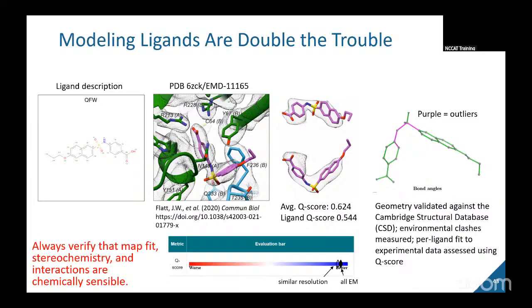And so a project I had was looking at a novel class of compounds that can target and neutralize enteroviruses and rhinoviruses. The way they work is they sit in this conserved, well-defined pocket on the surface of capsids and form stabilizing contacts. And it's these interactions that make them show up very nicely in cryo-EM maps. But despite having such nice density, they were still really hard to model.